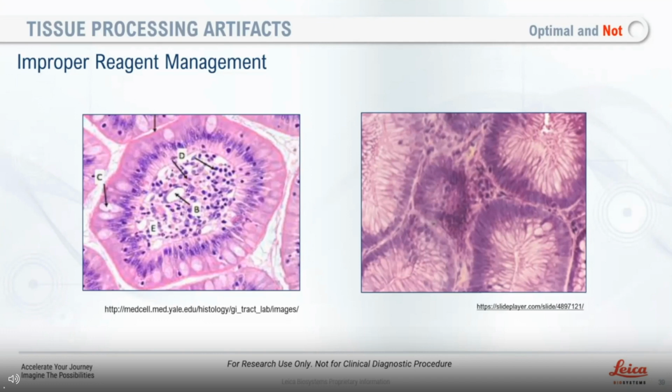It depends on the degree of calcification too. If it's just mild, you can go ahead and process the tissue. And then once you cut into the block, when it's in paraffin, you can just do a face decal to try to get that section. But if it's a little severe, then you definitely want to do the decalcification after you've done your fixation. Be sure and rinse it. All right. Thank you.